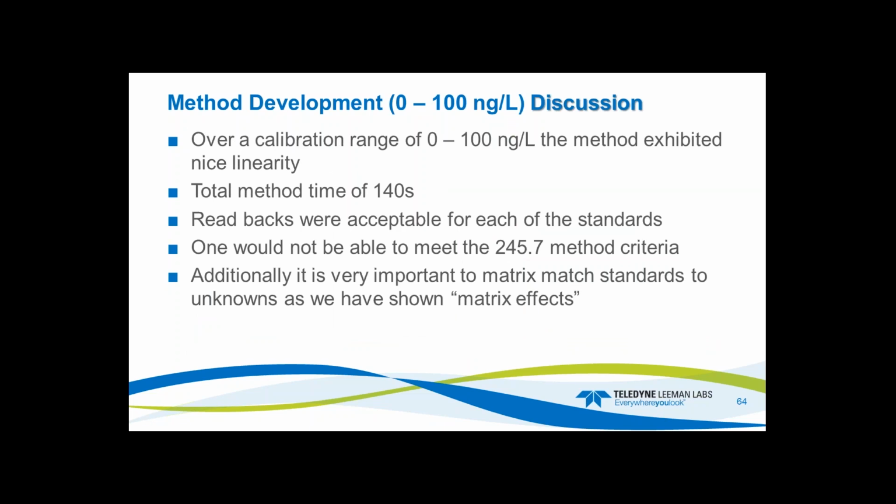Maybe we could dial in a little bit better, maybe improve it some with a change of the rinse a little bit. But again, this method wouldn't meet EPA 245.7. The system is just not capable of doing that. That has to have a method detection limit, instrument detection limit, method detection limit of 1.8 nanograms per liter. We wouldn't be able to achieve that with this system.